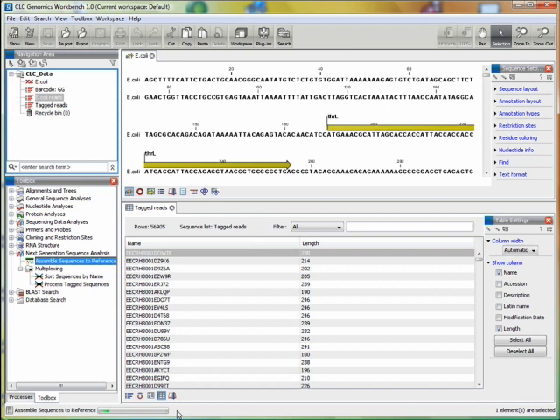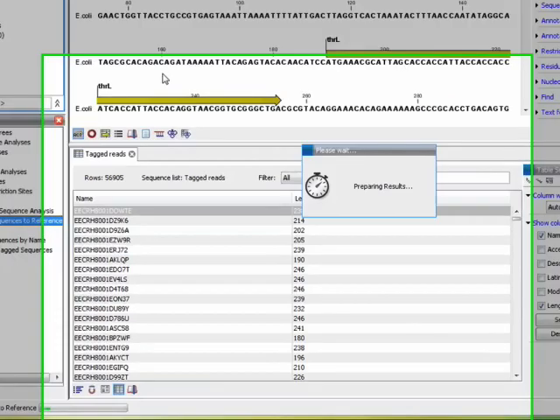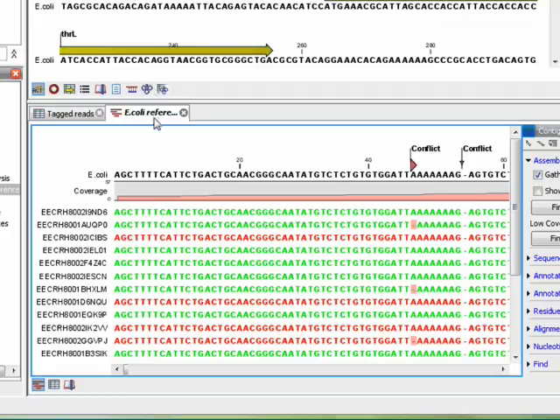Finally, a copy of the reference is annotated with the differences between the reads and the reference. The result of the analysis should be available in a few seconds. Now we have it.